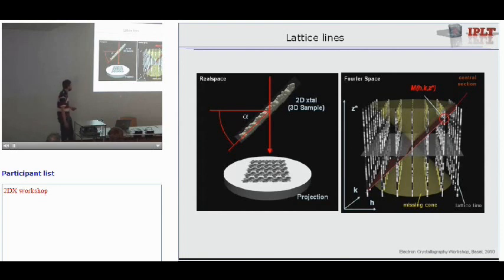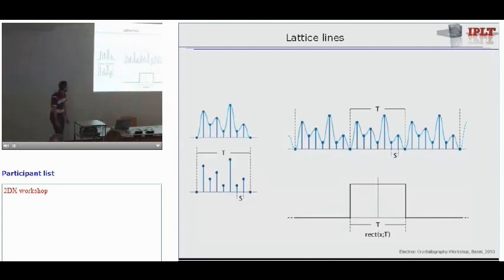And in general, for each crystal you record, you get one data point. Normally it's then more afterwards because you have a symmetry. So once you symmetrize, you normally get more than one spot on the same lattice line. Yeah, and you have also heard of that: you have a missing cone. So depending on how high you can tilt in your microscope, this might be smaller or bigger. With current microscopes, it's 70 degrees for the maximum tilt, so the missing cone is not that big anymore.